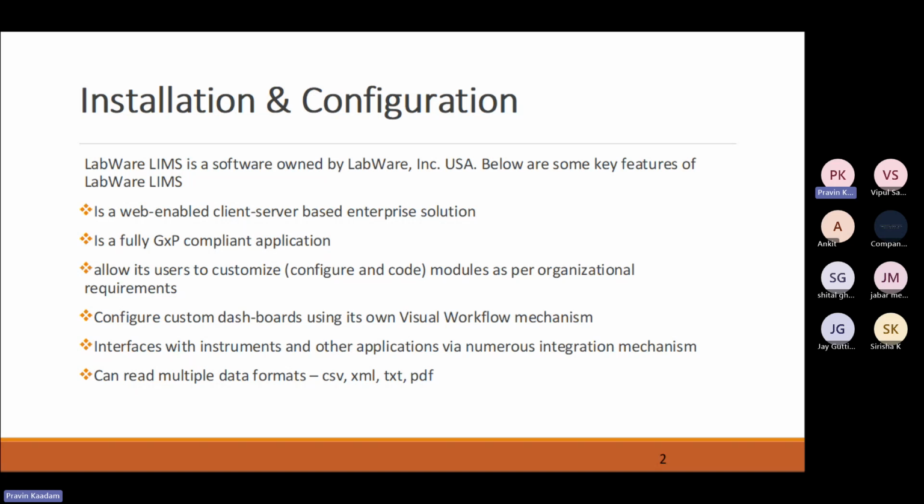There is a history, a log of each and every activity, and anytime you want, you can open the log and verify whether the activity was done by any user from the front end or by the system itself in the background, right from installation till the application is live in the environment. You should have a record of each and every activity.